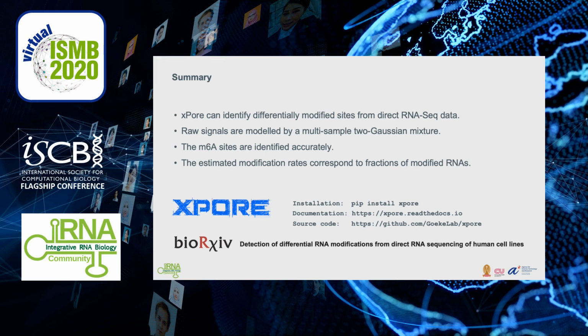And the estimated modification rates can be interpreted as fraction of modified RNAs, which we can use as complementary information to transcript expression profiles.